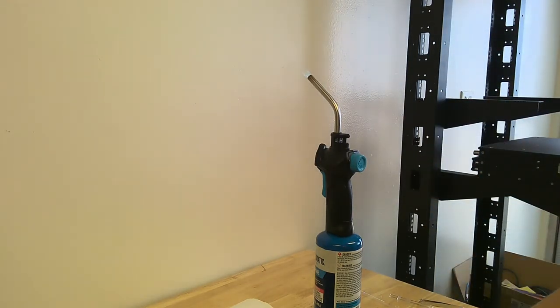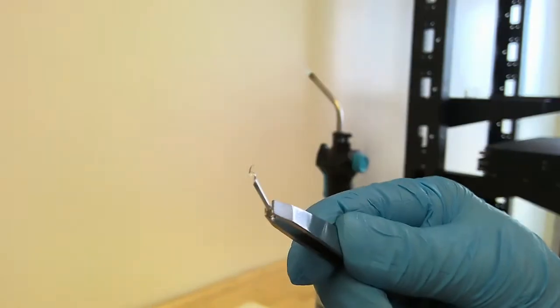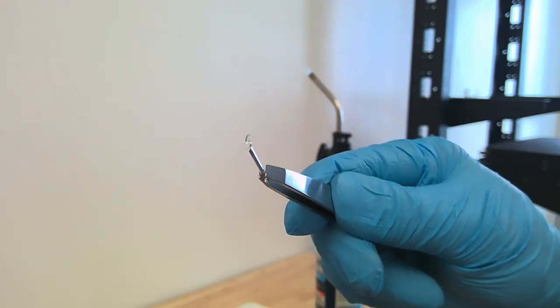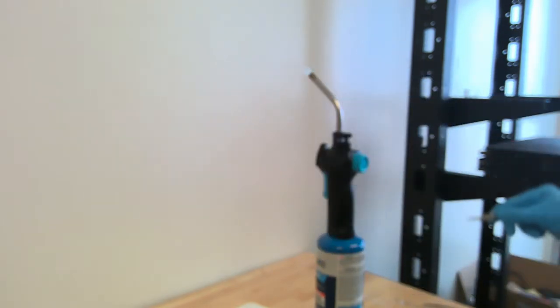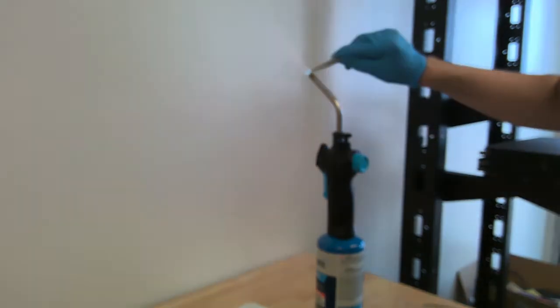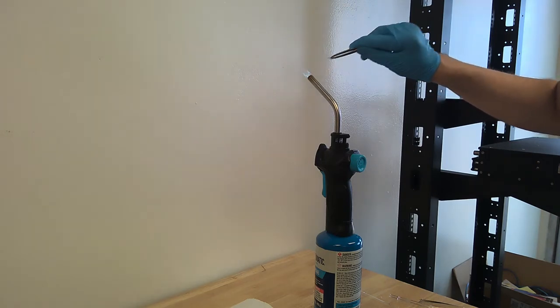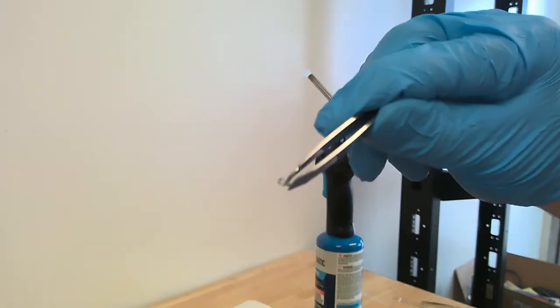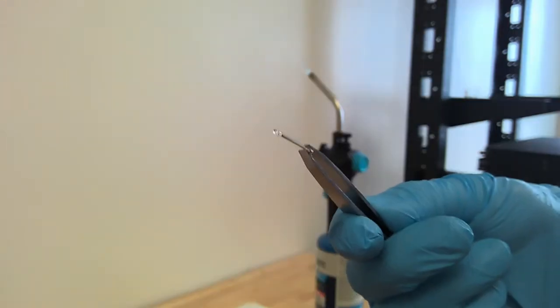We're going to allow it to sit and cool, and as you've noticed, the seal on the end isn't perfect. So we're going to run this through the flame to polish it down and make sure that the edges are completely sealed. The last thing we want is our reaction mixture going into our stir bar. Okay, so we've sealed off the end. We've made a nice bulb. And you can check that the stir bars are completely secure by, once they are cooled, immersing them in water.